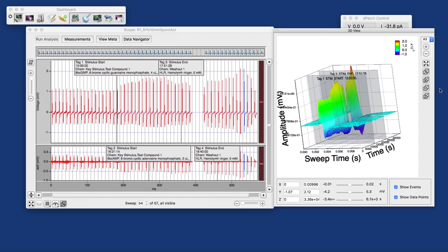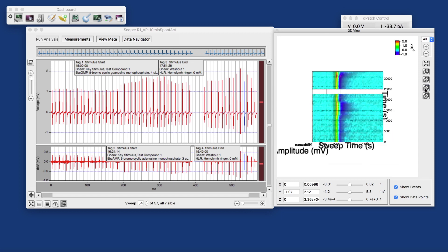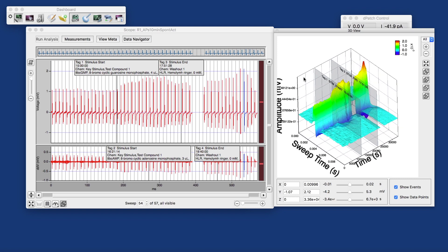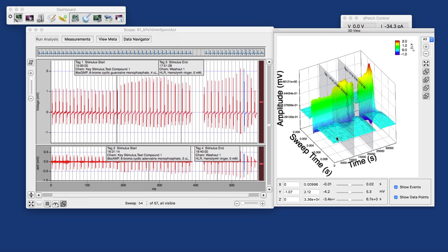Once you know what all this means, a top-down view — a column map — would actually give you most of the information: the relatively stable baseline, the peak-to-peak amplitude, and the repolarizing phase. But it's incredibly valuable to be able to show somebody what all that means.